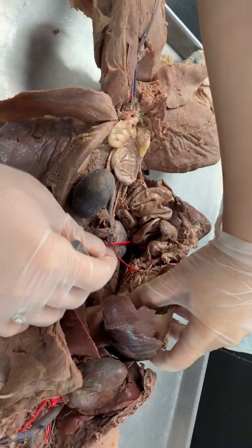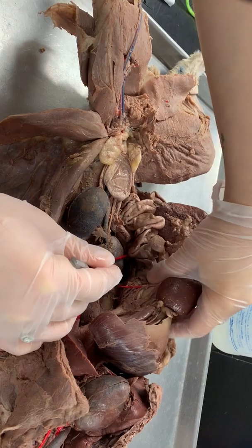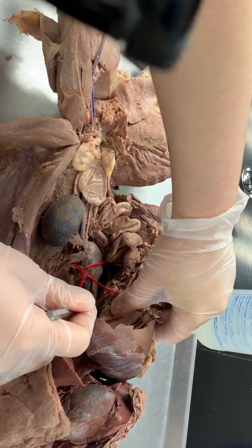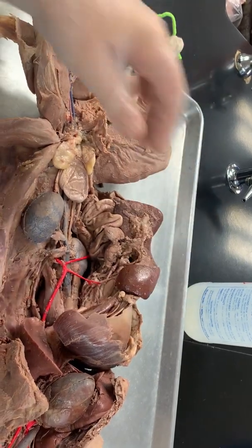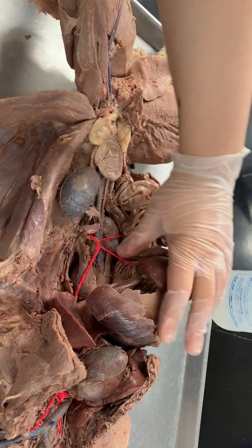And the trickiest to find is the hepatic, which is right here and goes all the way back to the liver. So gastric is right here, hepatic's right there. It's a nice example. Okay. Put all those organs aside.